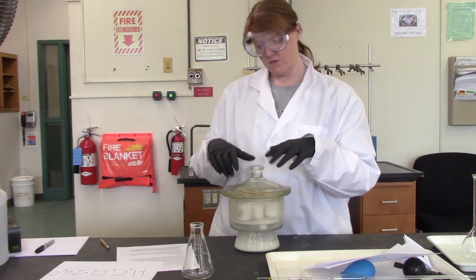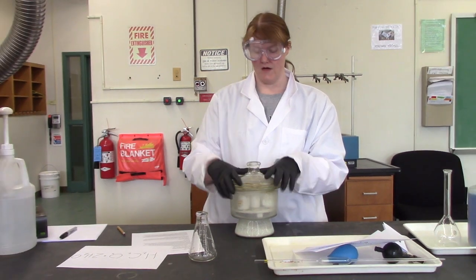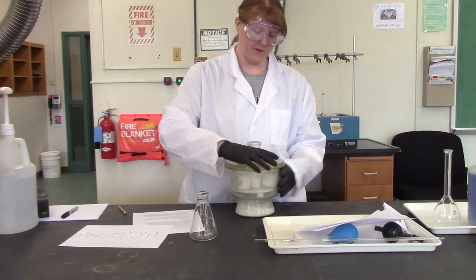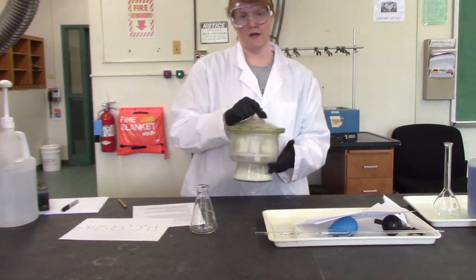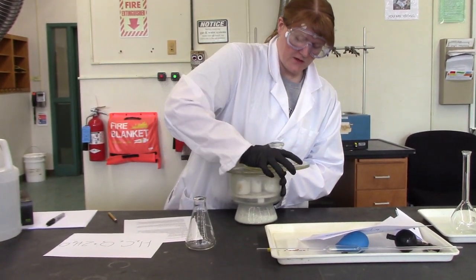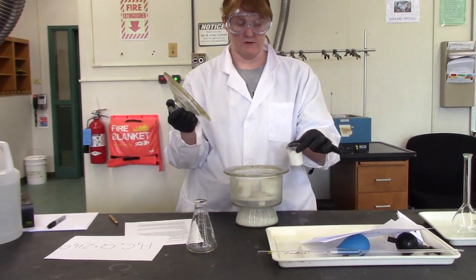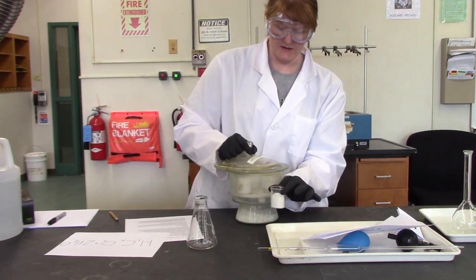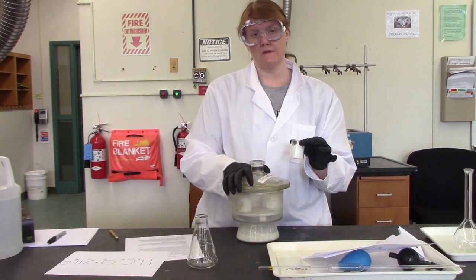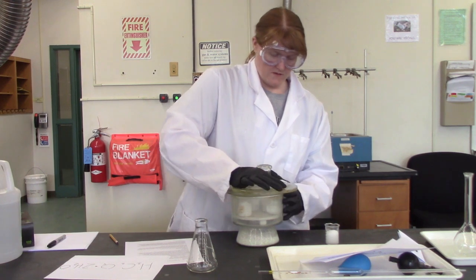All right, to get the lid off of the desiccator, and you're probably going to do this in the instrument room where we have our scales, I'll touch on that in just a minute, our balances that measure correctly there. To get the lid off a desiccator, you can't just pull on it. That doesn't work. You have to slide it, and it takes a little bit of elbow grease. So you slide it off, take out your solid material, and then slide it back on to close it up. Don't leave the lid off, even if you're just weighing it out. You don't want to leave this stuff sitting out for any length of time because it'll mess it up for everyone else after you.